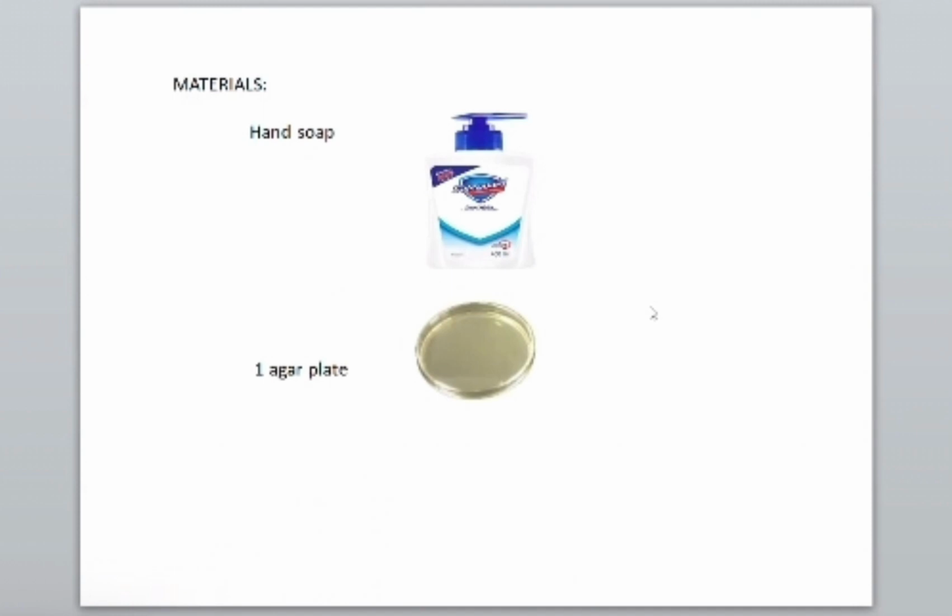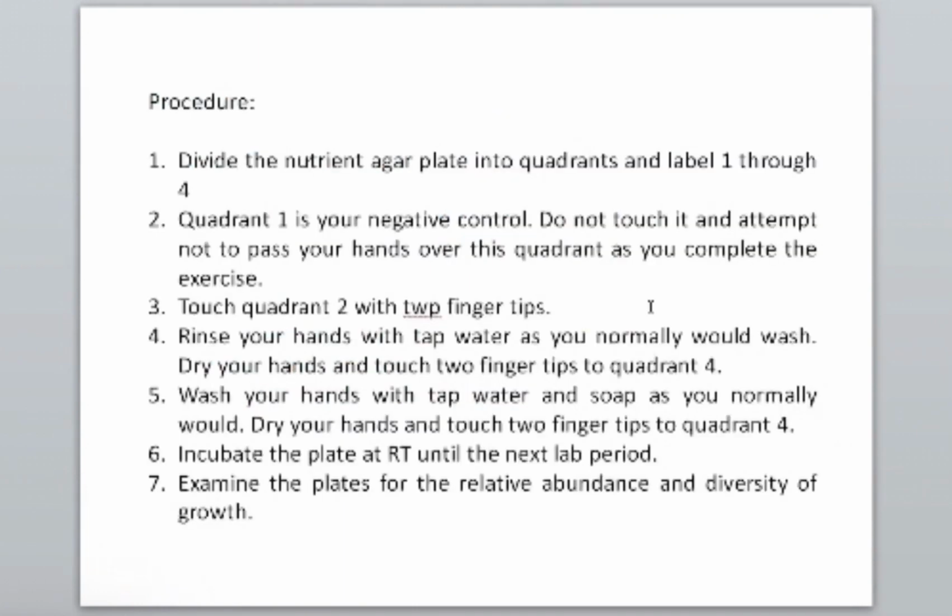Our materials for this experiment consist of only two. Number one is the hand soap. We can use bar soaps, liquid soaps, gel, or alcohol if one has, and one plate of agar.